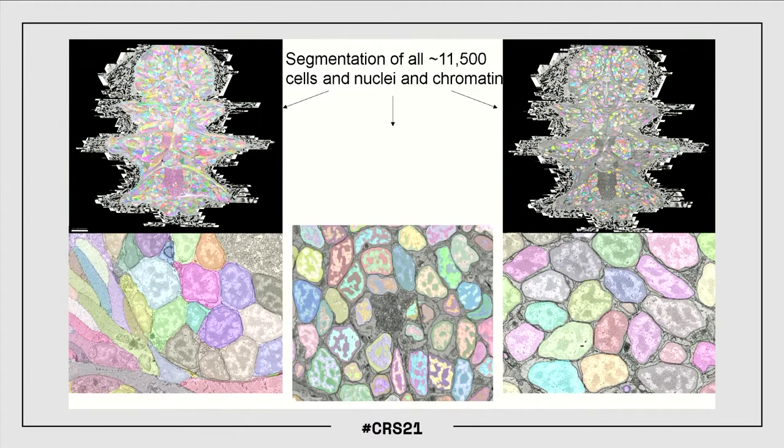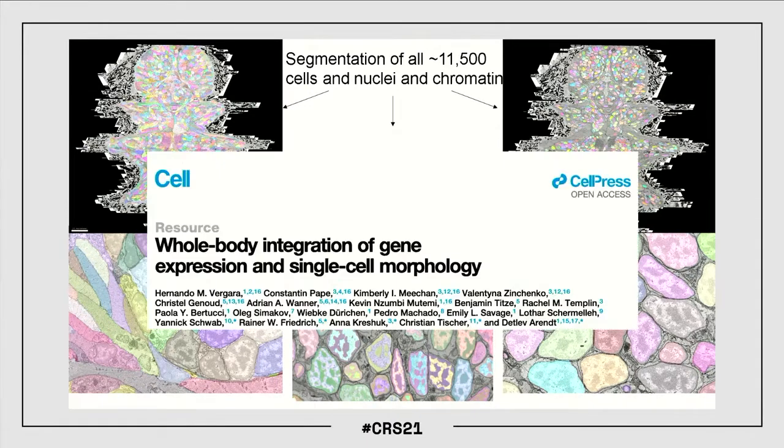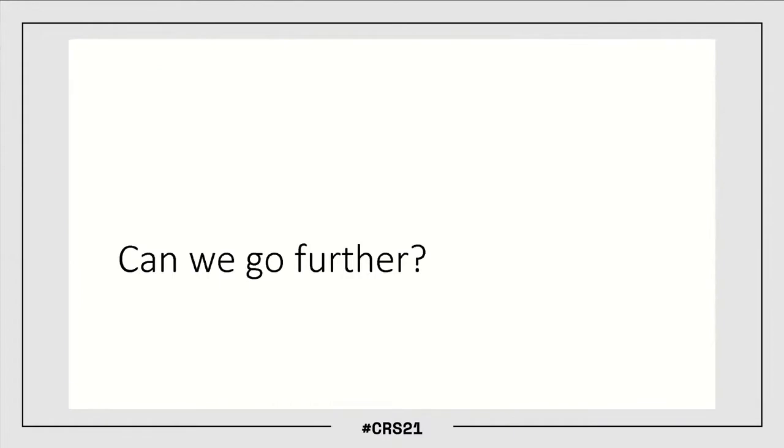And well, then it turned out that having segmentation like this is actually a very enabling technology, and our colleagues in biology have used it then to build the whole resource of how you can analyze an animal like this and analyze the morphology of every cell, also together with the gene expression information. So that was fun, but it felt like we should be able to go much further, because this kind of repulsive and attractive potential, that's like a nice abstraction, but there is actually more.